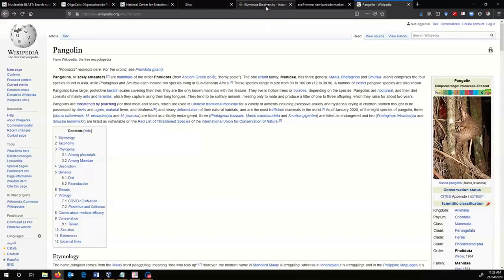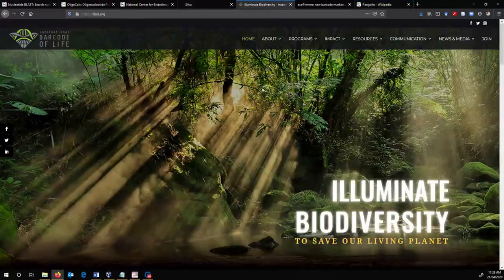I have talked about the International Barcoding of Life database and the cytochrome oxidase 1 mitochondrial DNA sequence. That's been used extensively and can even separate between most species of living animals. So if you want to look at closely related species of insects or crustaceans in the sea or something like that and tell them apart, then this you would think would be a reasonable way to do it.